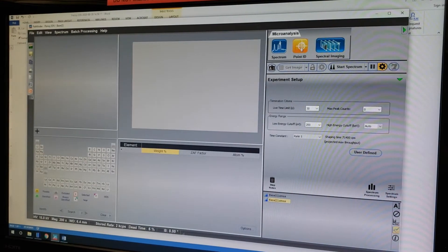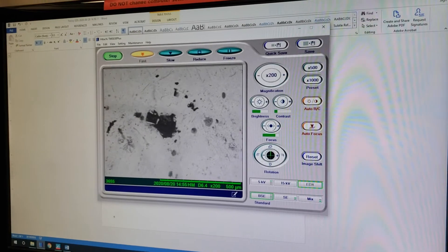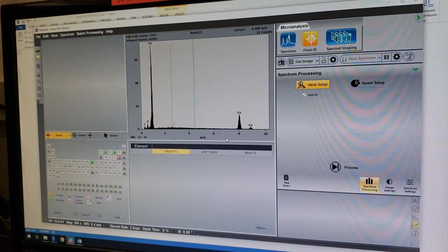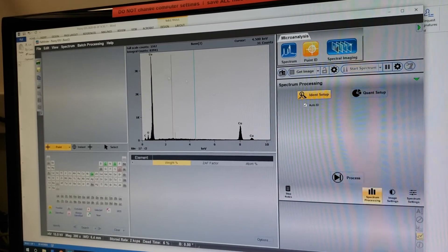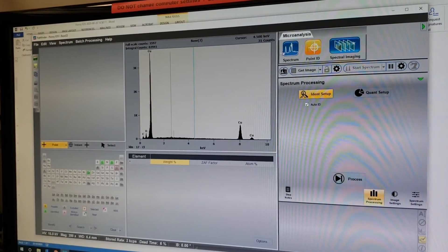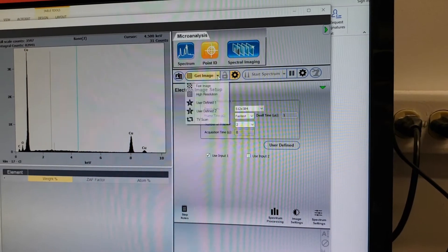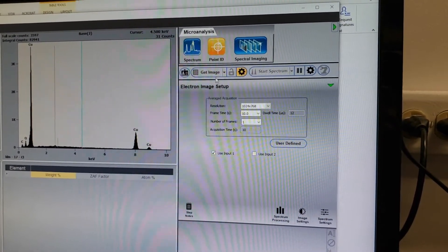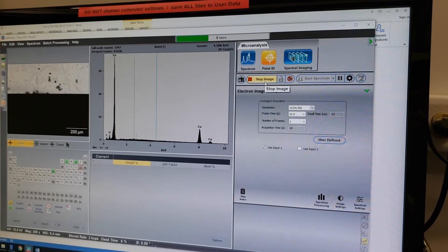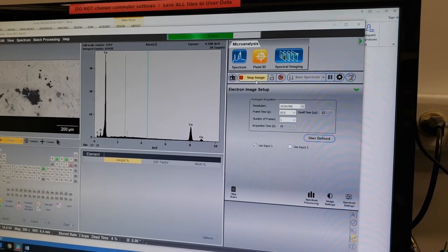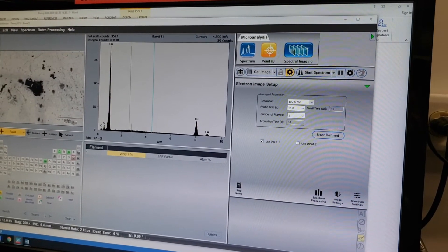Next, onto Point ID. Point ID is going to take an image from our imaging software. We're going to be able to select points on the image, and it will take spectra at those individual points. We're going to click on the dropdown button here, click High Resolution, and click Get Image. Before we do that, make sure you have a nicely focused image, and that brightness, contrast, rotation, and all image settings are the way you want them.